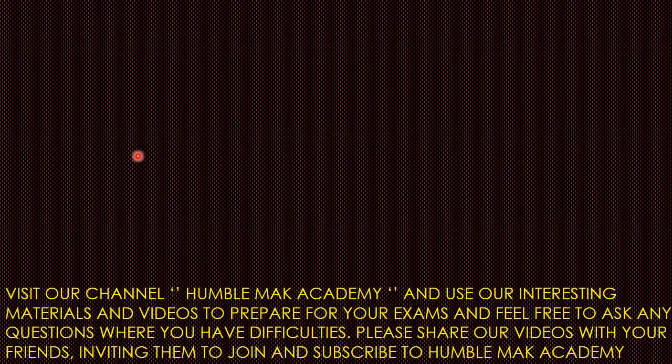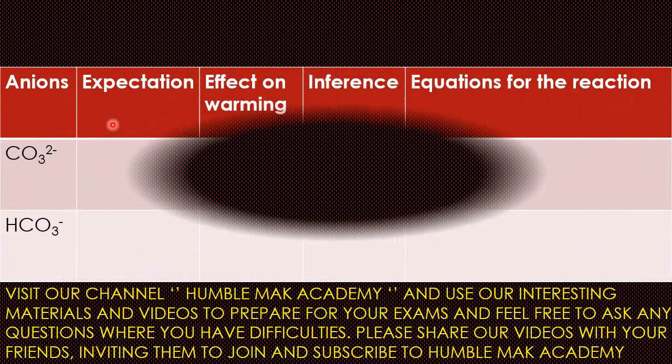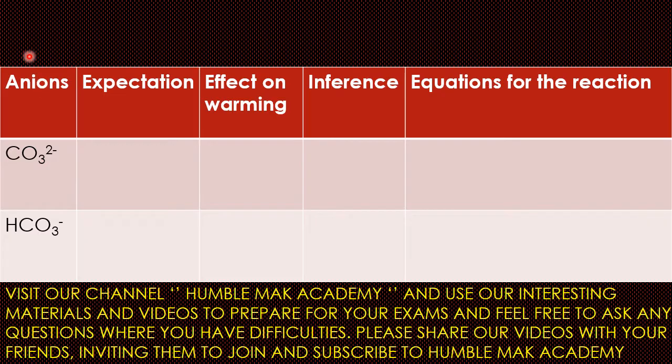Okay guys, as usual, let's set up our table to see how far we can go. Voila, great. So I have the ions, I have the anions here because they are negatively charged ions. We have our expectations. We have the effect on heating, guys. In this case, we are going to be heating. Then we have our inferences. We have the equation for the reaction. Good.